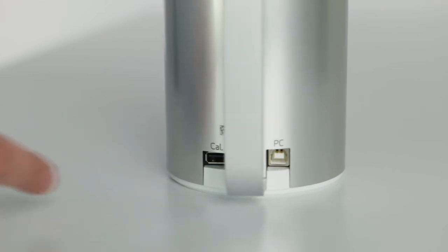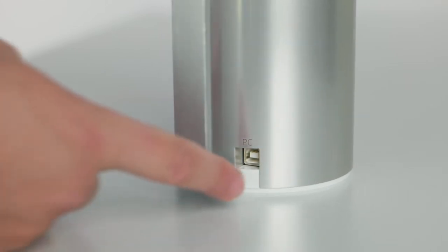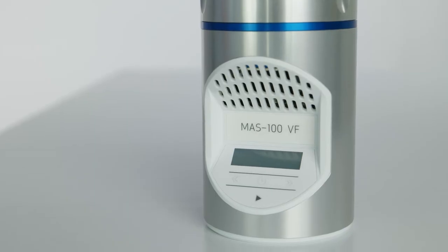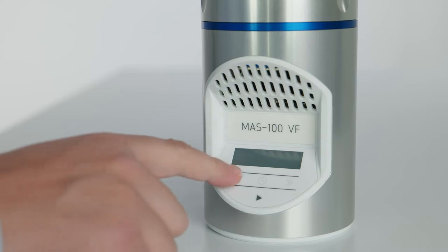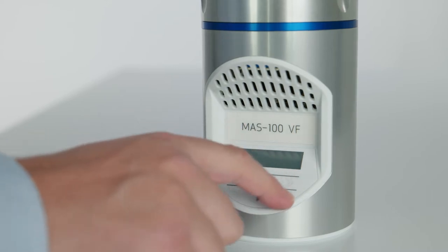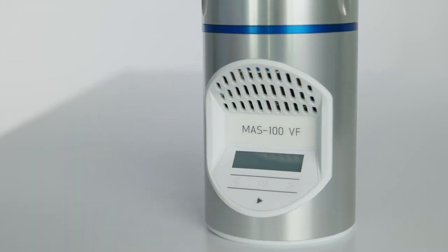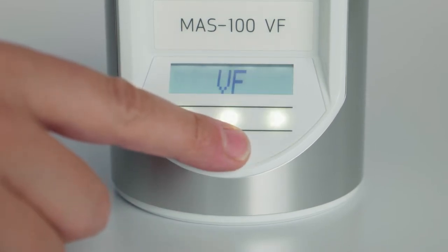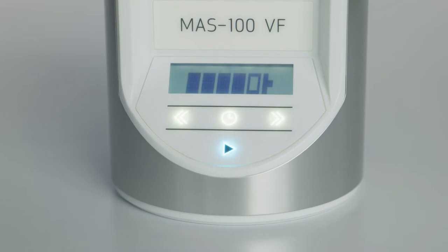Here on the back are two plugs — one for charging and one for data exchange. Both functions are performed with the USB cable that is part of the package. Ease of use in daily routine is guiding our product development. All functions required for daily operation are accessed through the keypad; some of them can be blocked to prevent errors. You will start up the sampler by touching the start button for two seconds. Then it will show VF and thereafter the battery charging status and the remaining time of calibration validity.